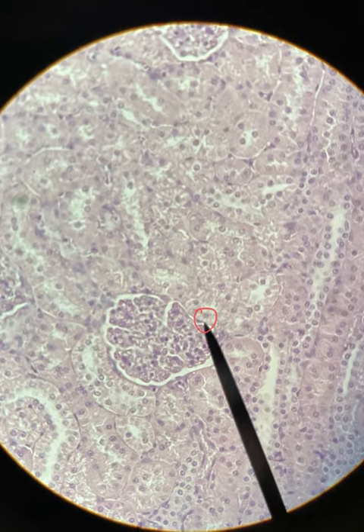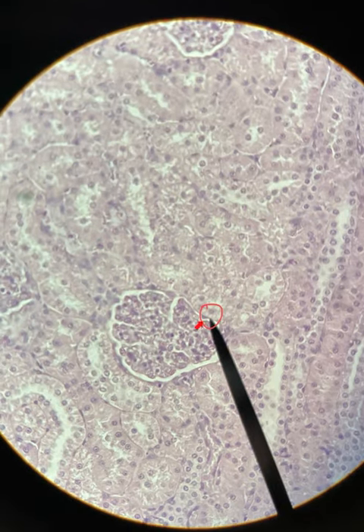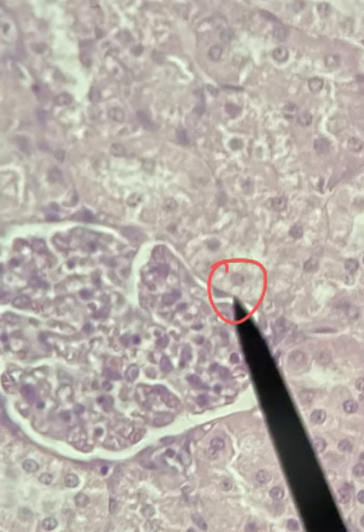Okay, now here we have another pointer, and it's pointing right to, I've circled it, this little teeny flat cell. It looks like it's really squished. You can't even really see the cell, you just sort of see the nucleus. This is a simple squamous epithelia. Simple squamous, so it's squashed. Because they're so small, they're really helpful in facilitating filtration and diffusion. So think about where you would need filtration and diffusion: the air sacs of the lungs, right? Diffusing that oxygen.